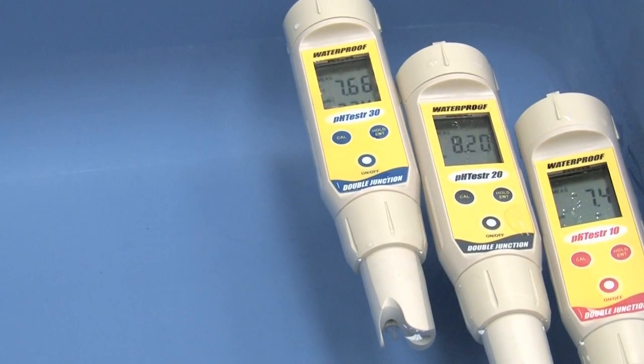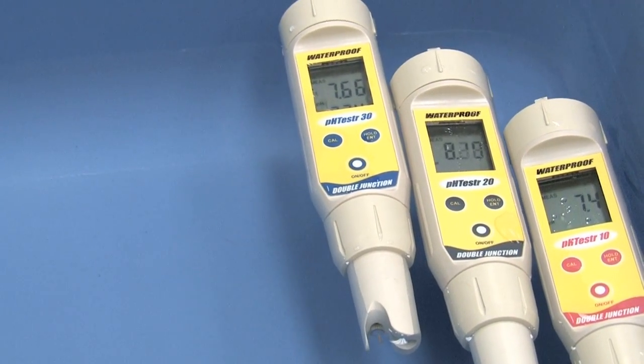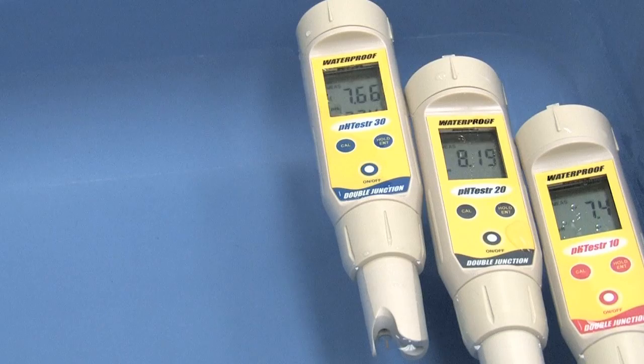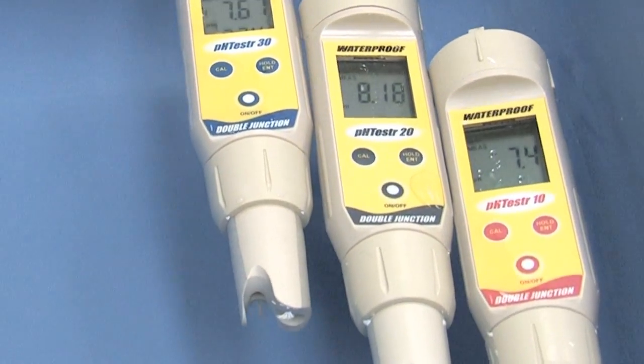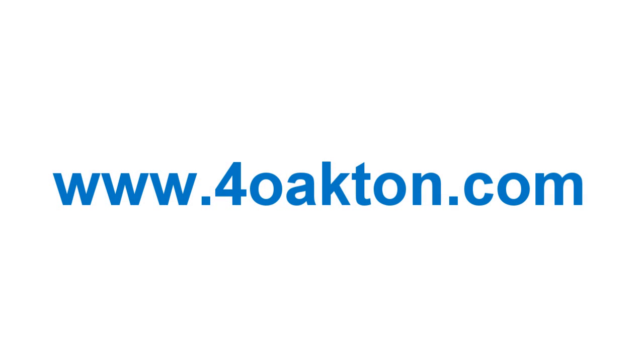Depend on Oakton for pocket pH meters. For research, low-cost, or multi-parameter models, Oakton has the pH tester you need. Check out all of the Oakton Waterproof testers at 4oakton.com.